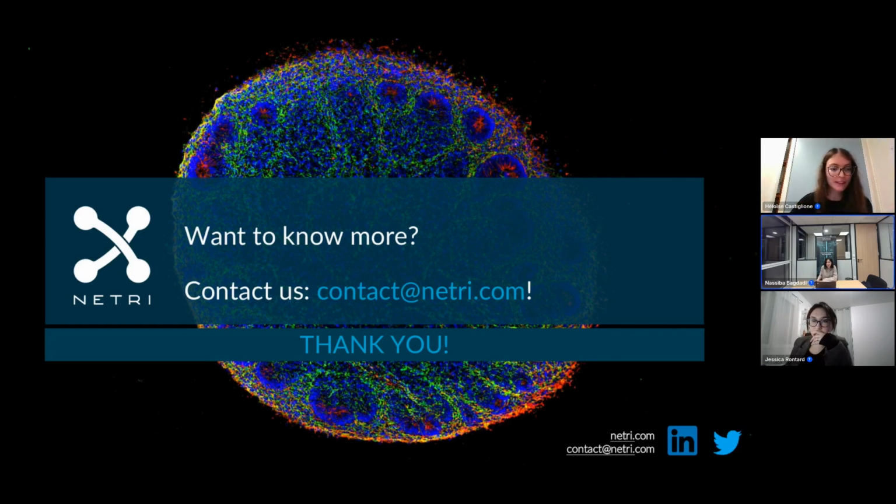Go ahead, Eloise. Yes, it's a very interesting question. Regarding the necrotic core, in fact, we don't really have this issue, even in the conventional cultures, probably because 2 to 4 months of culture is not so long and the organoids do not grow so much.